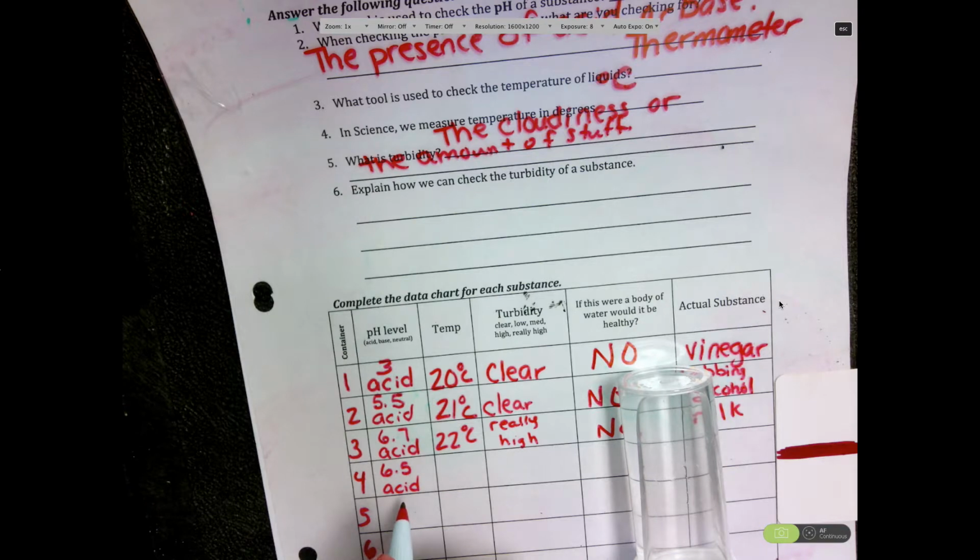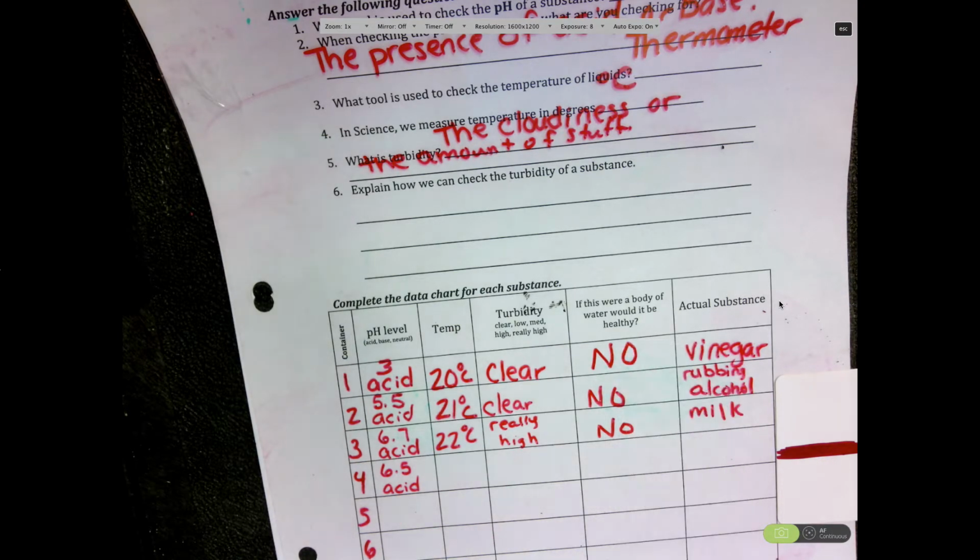If it's below 7, it is an acid. If it's above 7, Patrick, it's a base. You can't be in between. No, it's acid. The temperature of this substance is 20 degrees Celsius.